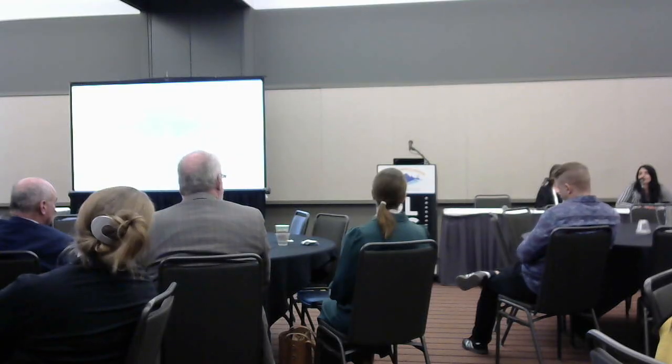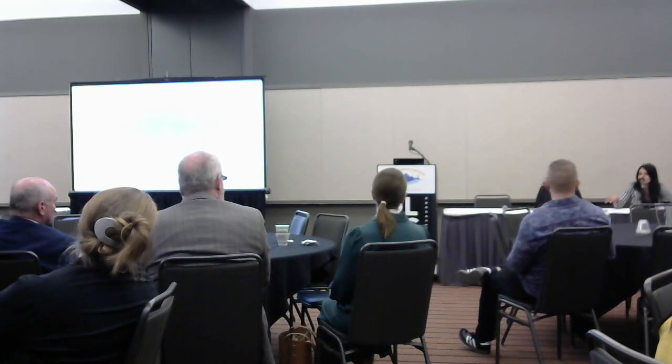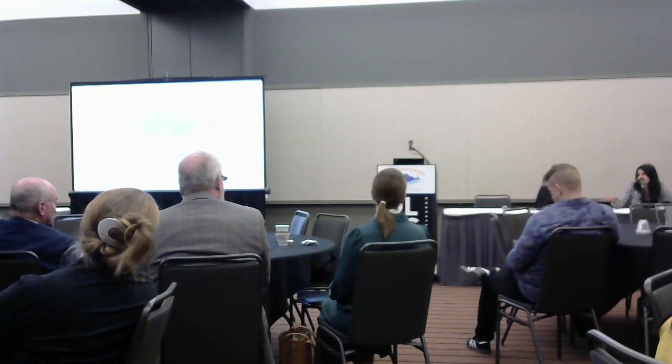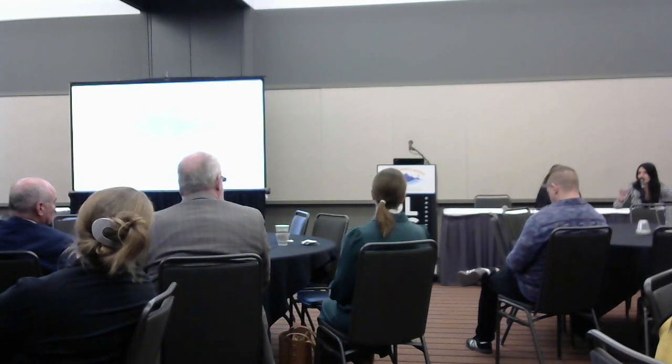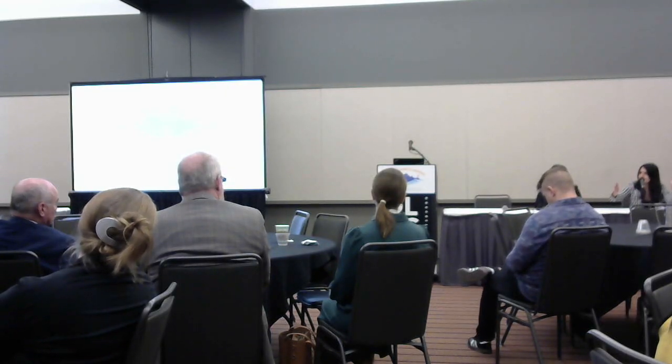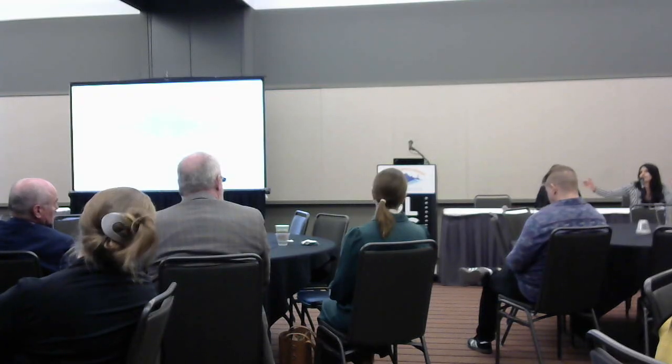Yeah. So we got the light sheet fully set up in October, so we've only had it for 5 to 6 months. But at least so far, what I've been trying to communicate is, you have your raw file out of the instrument, then your destriped files, then your stitched file, and then the IMARIS file.